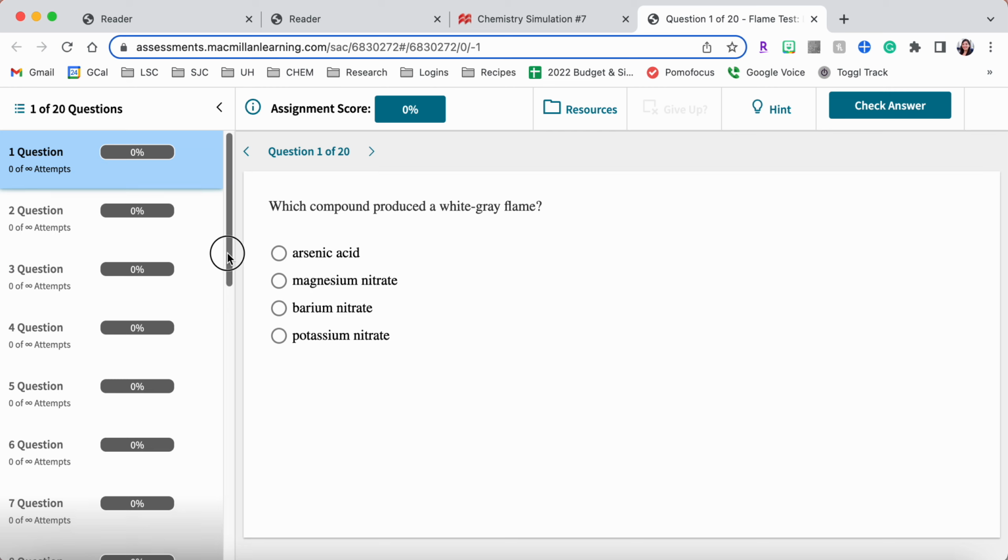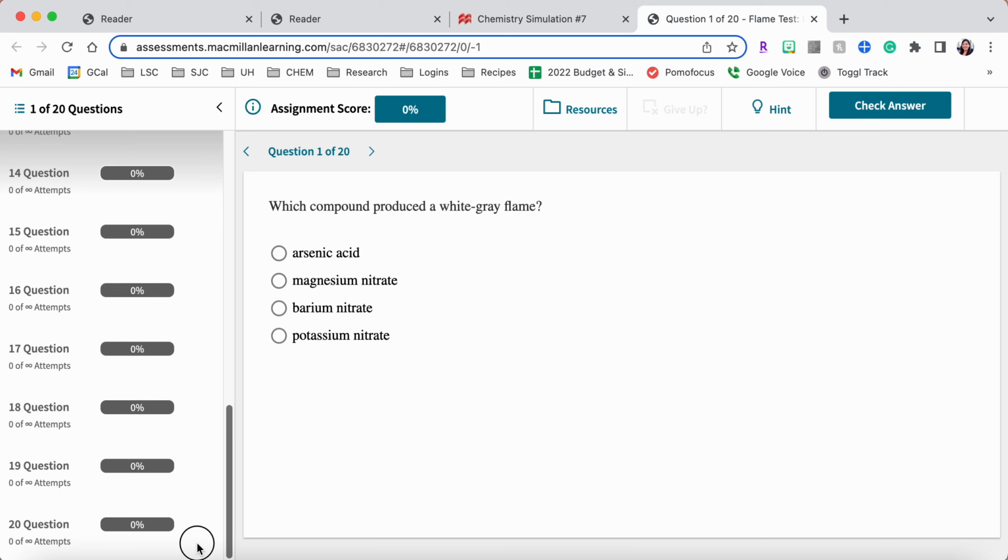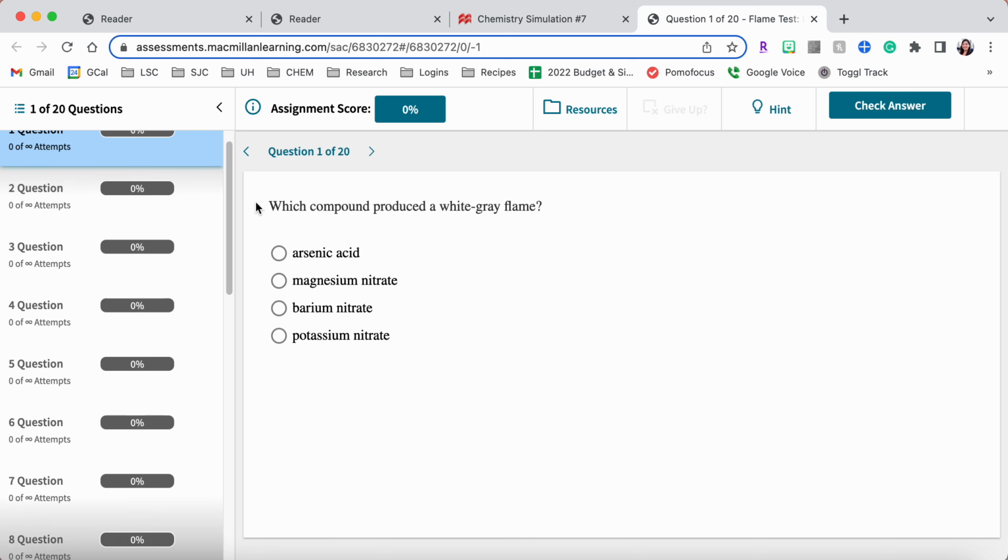So for the lab assignment, you'll notice it is less questions in comparison to the previous lab. So that's a thumbs up, right? And the good thing about this lab is it's fully qualitative. So we are looking and recording qualitative observations. And all that means is that you're observing the colors, and you're not observing quantities, right?